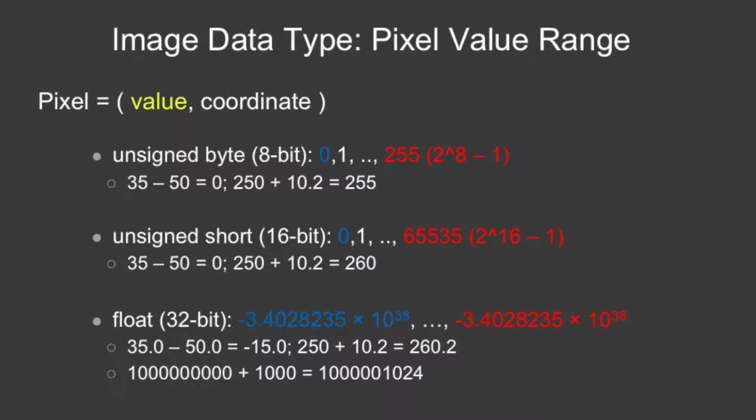So if I find a lot of 255s, then this is a sign that the detector has been saturated. If there's a lot of regions with plain zeros, that's actually a sign that it has been undersaturated. So basically the signal was cut at some point, which looks nice because you have a very clean background, but in fact it's not so good because you don't really know where your zero level was. So this is also not a good image.